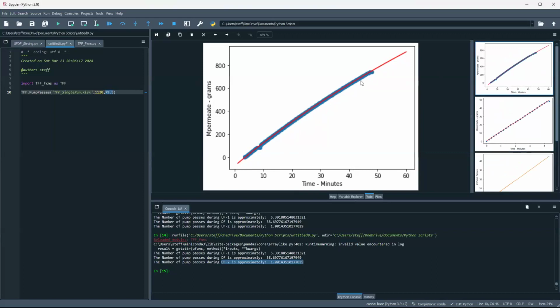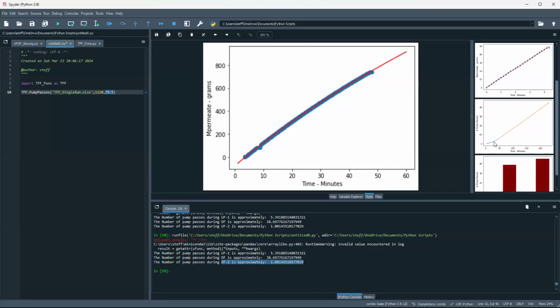So what's nice with that log function is if you have not a lot of flux decay, you can capture that linear section. Your log function will change, but it'll still be able to be modeled by that log function. And then if you get a lot of flux decay, you're also going to capture that situation. So that's why I like the log function. Maybe you have a better one to fit your data to.